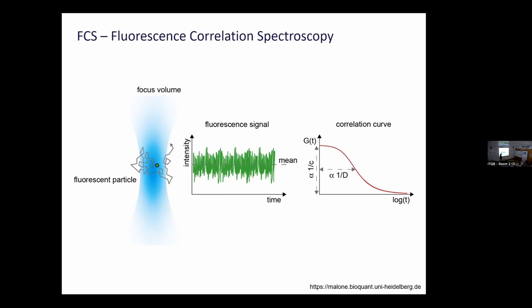The idea is, if the molecules move slower, you will see patterns of fluorescence that last longer, that will show a higher correlation with time. If they move fast, it's a little bit noisier. They'll show a lower correlation. So from the shape of the correlation curve, we can also estimate the mobility. And because we know exactly the shape of the illumination in the confocal, and we know what signal to expect from molecules diffusing at different diffusion coefficients, we can extract also quantitative parameters in a very, very, very tiny region. One of the things that people started to figure when they compared the FRAP with FCS is that with FCS, you could sometimes measure much higher diffusion coefficients. And people soon found that in the nucleus, it's not really diffusion.